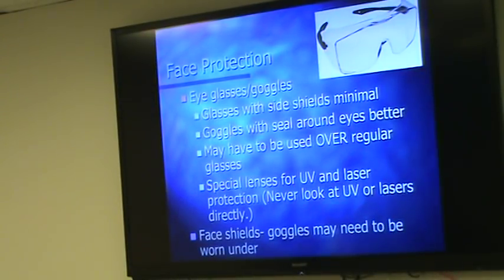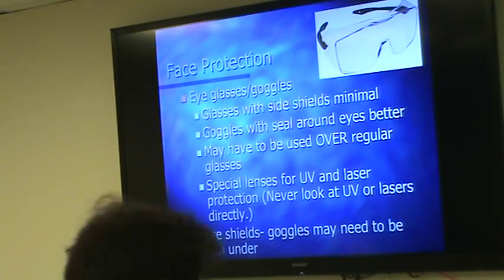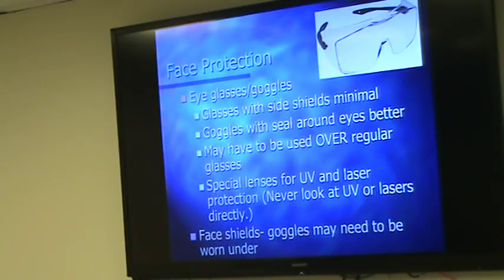Should you need to have eyeglasses or splash protection, anything that doesn't have side shield is considered unacceptable. Goggles with a seal around your eyes, if you truly need eye protection, are considered better. Just for a lot of people that wear prescription eyewear, a lot of folks would like to think that that's sufficient. It's not, so if you truly have a splash concern, then you may need to use those eyeglasses and splash guards over your prescription glasses, because not any prescription glasses that I know of have the side shields or the top piece. And you can see those glasses up there have not only just the side shield, but also a top piece. I know there are a few UVs and laser around here.